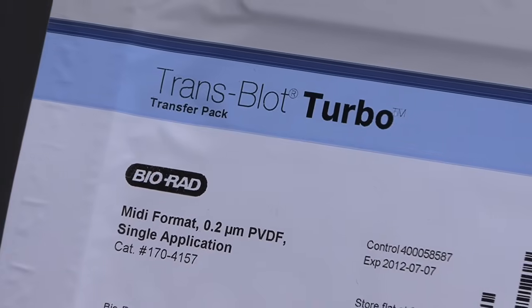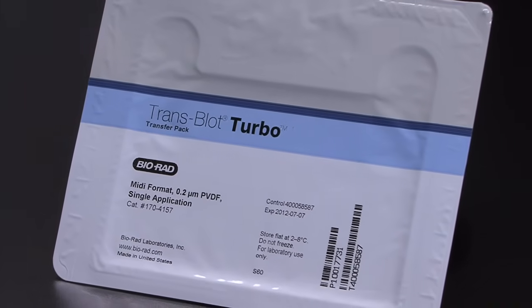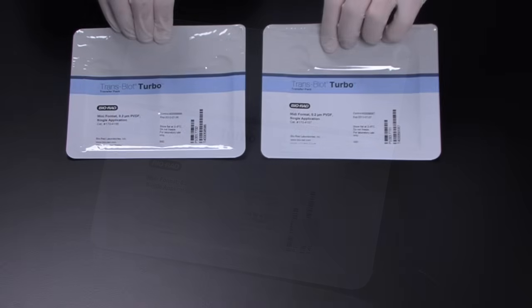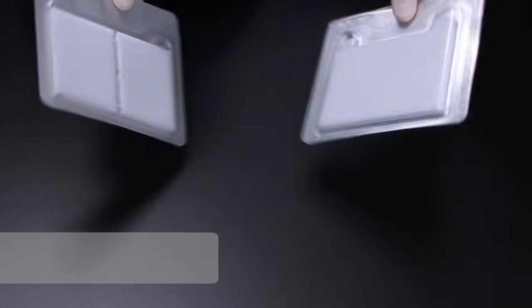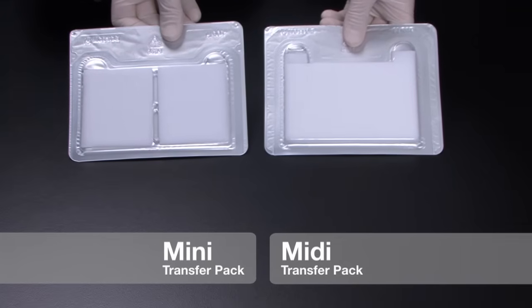While the system can be used with standard semi-dry blotting reagents, turbo transfer packs are necessary for rapid transfer applications. We have these transfer packs available separately in mini and midi size with PVDF or nitrocellulose membranes.